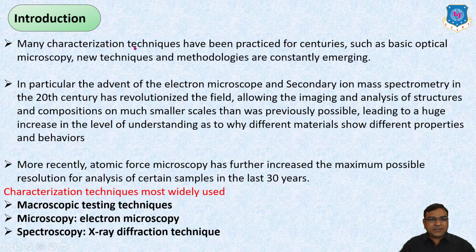Many characterization techniques have been practiced for centuries, such as basic optical microscopy. New techniques and methodologies are constantly emerging.